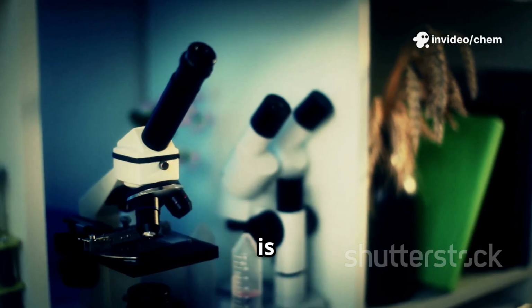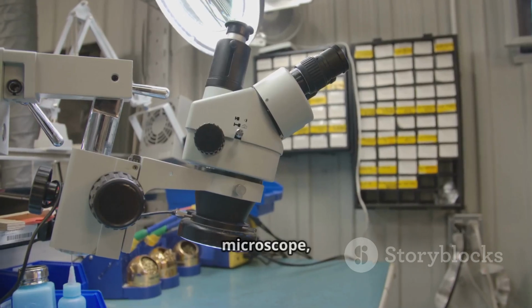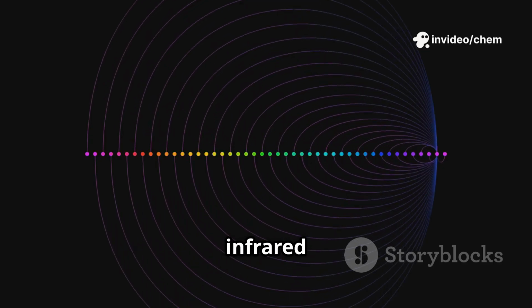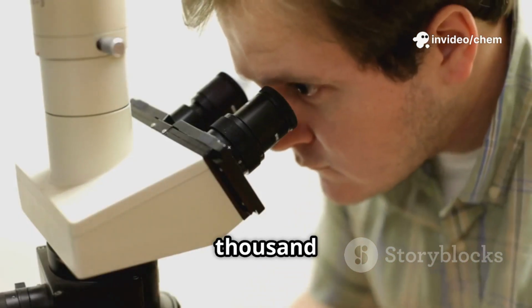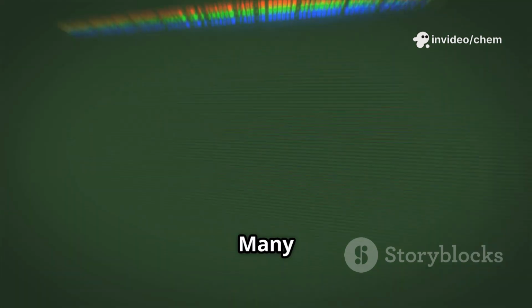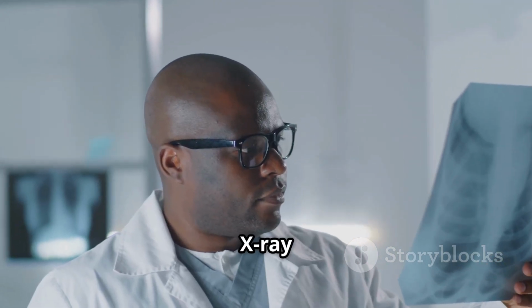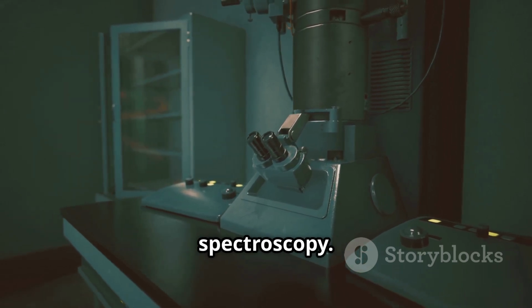Electron microscope is an imaging tool with much better imaging resolution compared to optical microscope, which uses the ultraviolet, visible, and infrared region of electromagnetic spectrum, from 190 to 1000 nanometers. Many techniques use electromagnetic rays in different ranges. For example, X-ray diffraction and infrared in Fourier transform infrared spectroscopy.